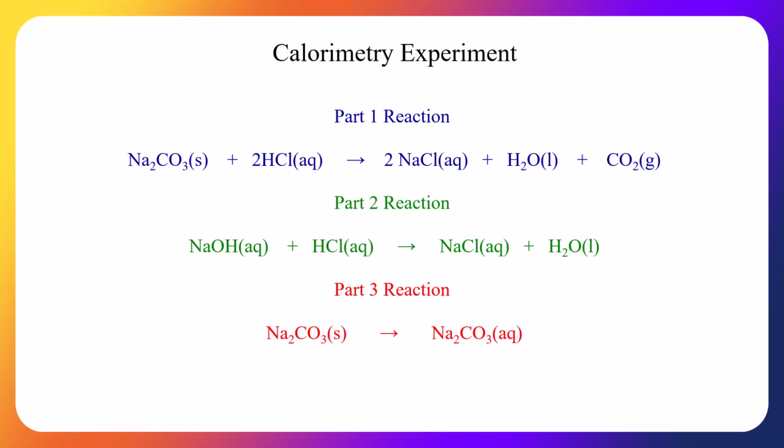And in the third part, we're just going to take solid sodium carbonate, put it in water, and it's going to go into solution, and we're going to repeat the same process. The third part, there is no limiting reagent because there is only one reagent.